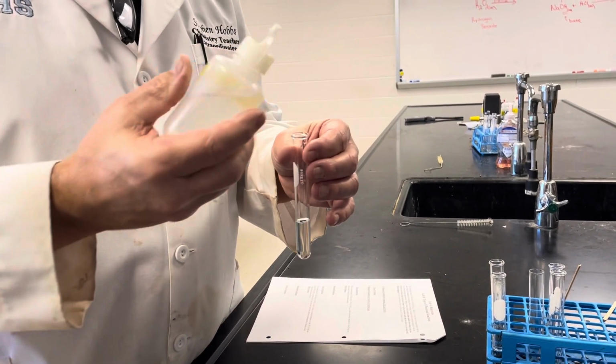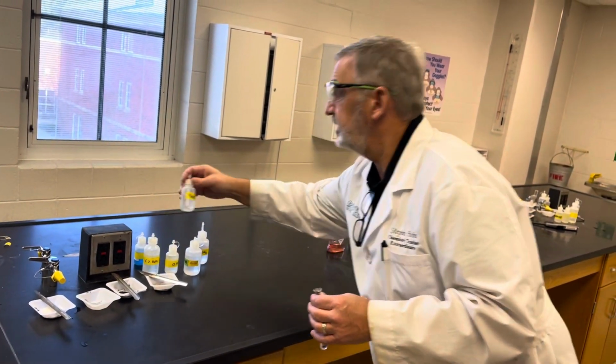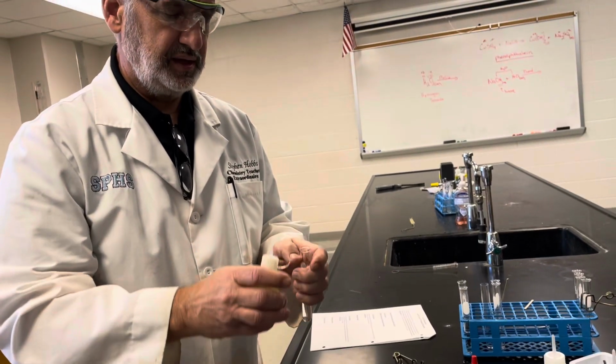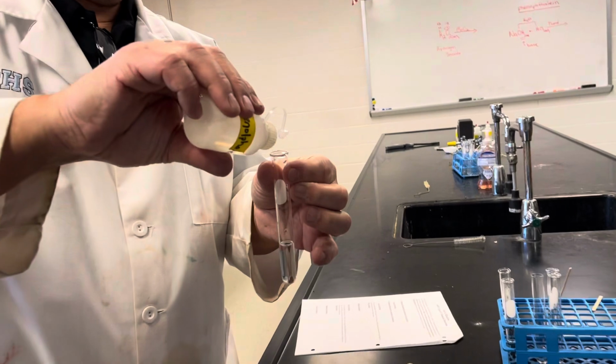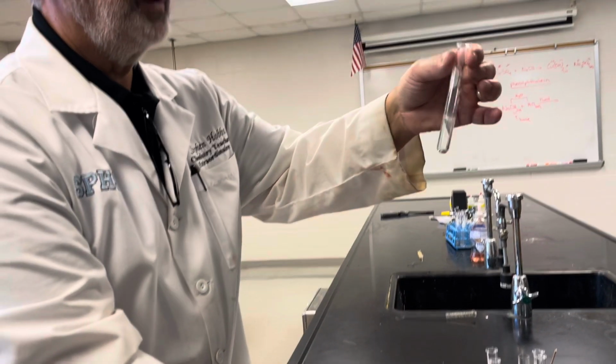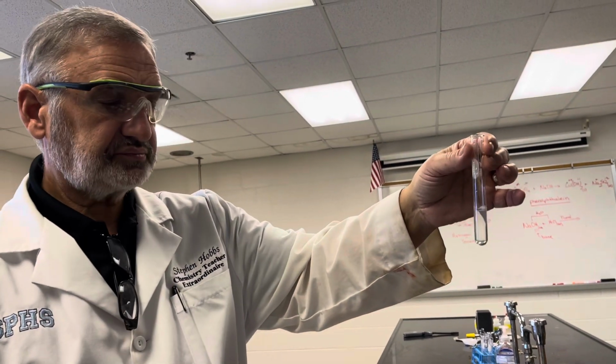Ooh, okay. Note to self, we need to fix that bottle. So we go over here and get another bottle. Same stuff. Try again. 1, 2, 3 drops. Okay? And notice there's no real color change.